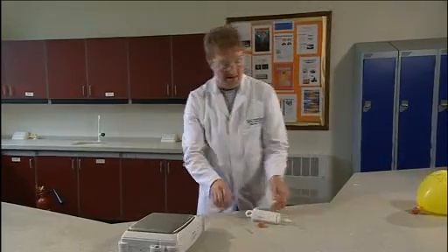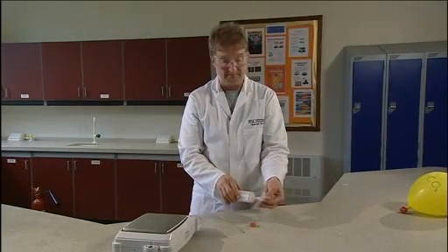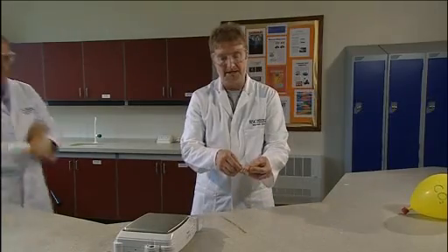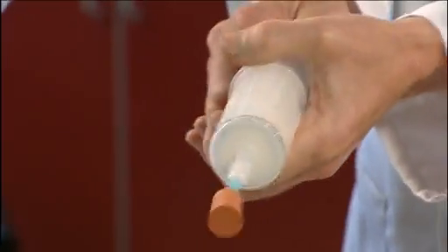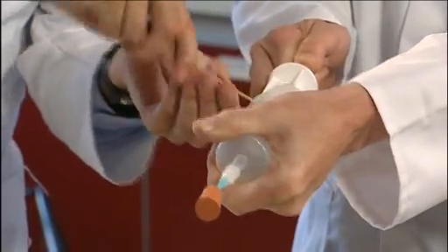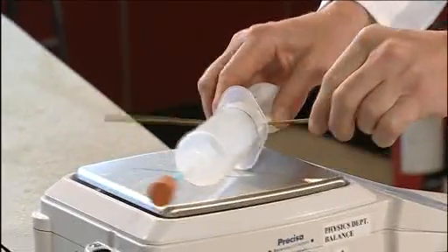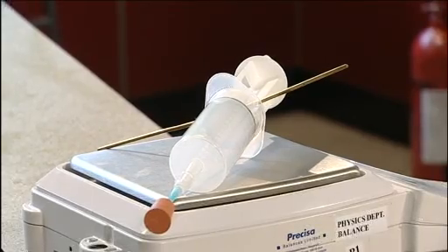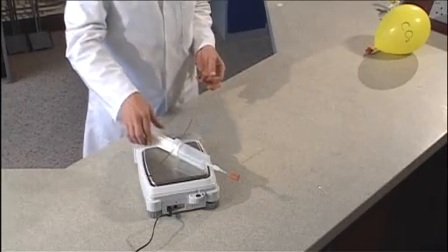We first want to weigh, in effect, the syringe plus 100 cubic centimeters of vacuum. Put the hypodermic needle on the end, seal it with a rubber bung, and pull the syringe out. This is quite hard work, to beyond the 100 cubic centimeter mark and lock it with the metal rod. This can then be weighed on a top pan balance, which needs to weigh to 3 decimal places. In effect, we've weighed 100 cubic centimeters of vacuum plus the syringe, etc.